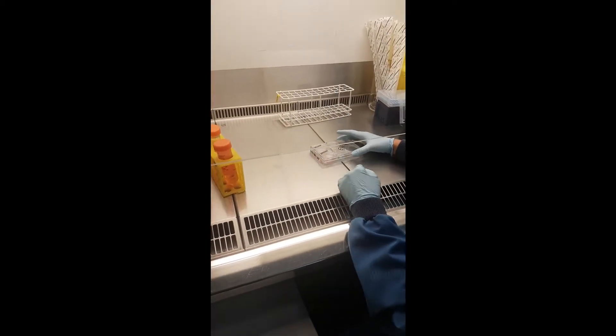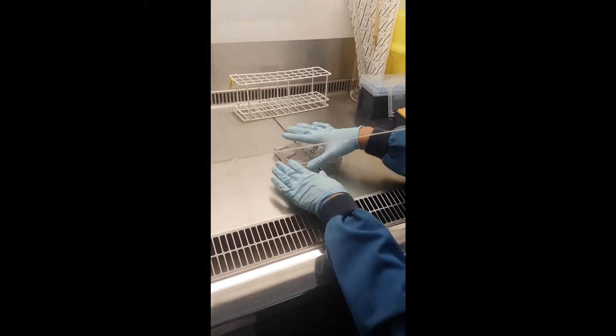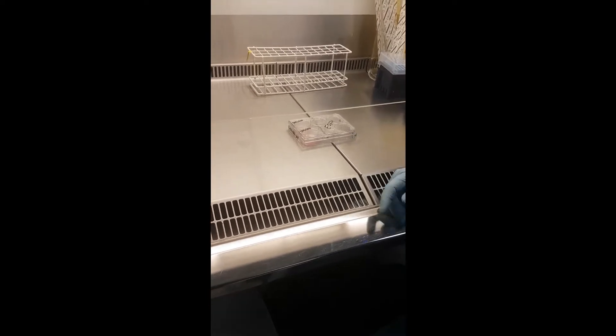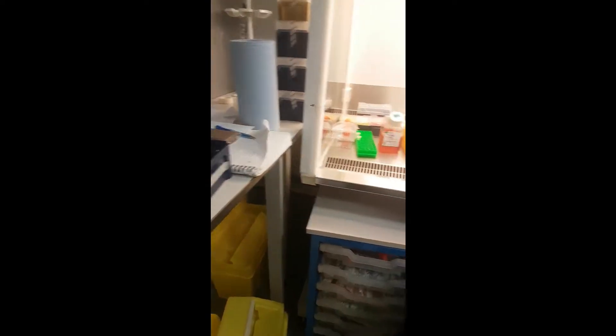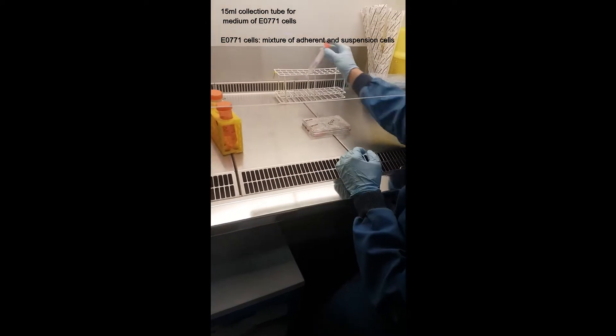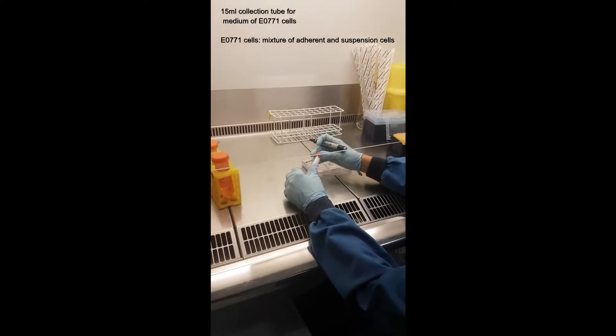This is an example video for growth curves. We already take the source and put them here, but ideally you prepare the plastics you need before starting. We need a collection tube for medium — E0771 cells always need to be collected because there's a mixture of adherent and suspension cells.